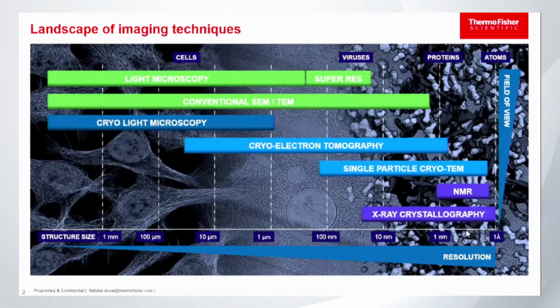Again, I have a big bias for electron microscopy because I was a crystallographer when I did my PhD, but I transitioned to electron microscopy almost 20 years ago. I love it, and I think it's very powerful, but I highly recommend having access to every single technique if you really want to understand your biological problem. The more techniques you can use, the merrier, because everything is overlapping and everything will help you to understand your final goal.